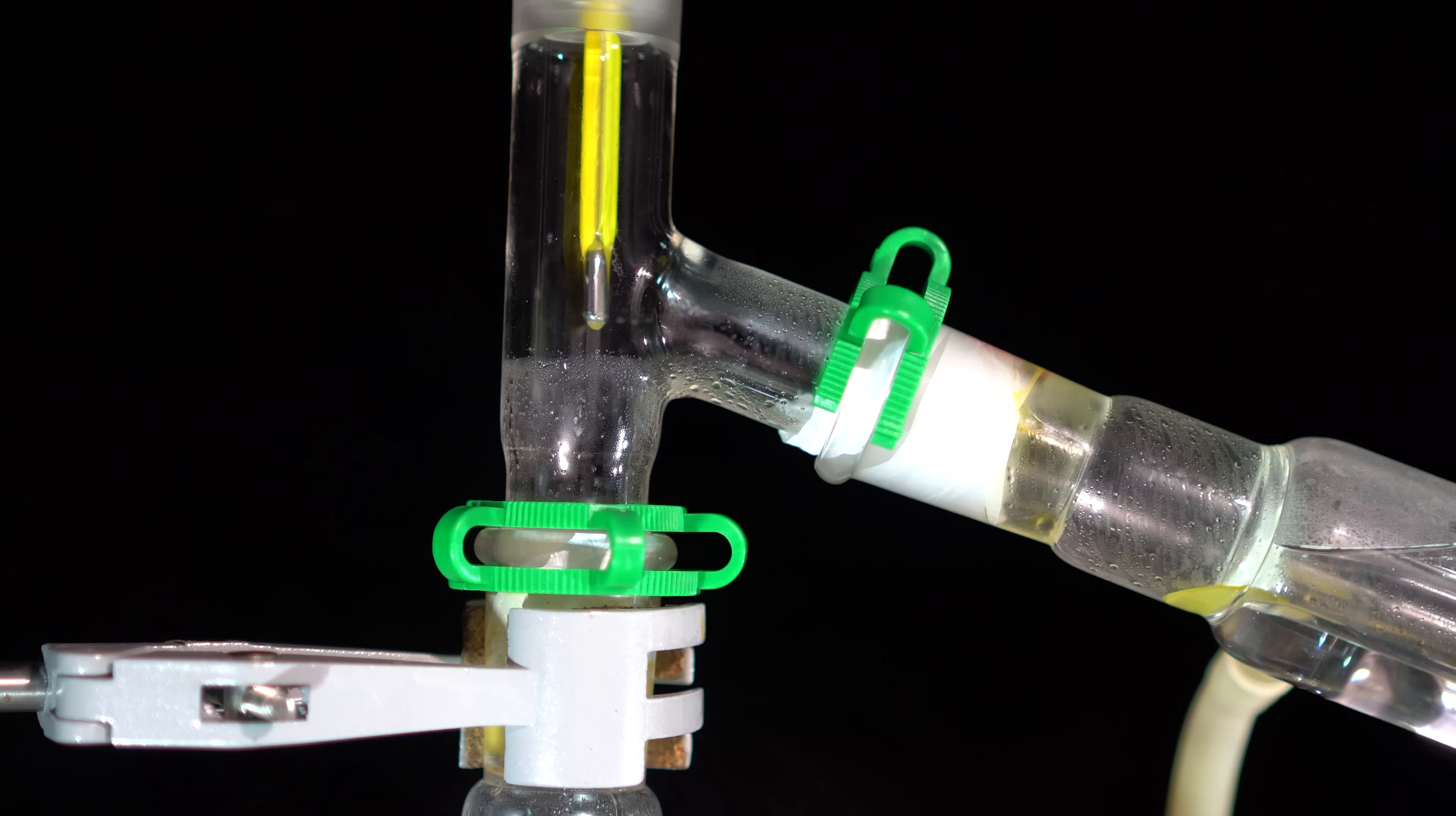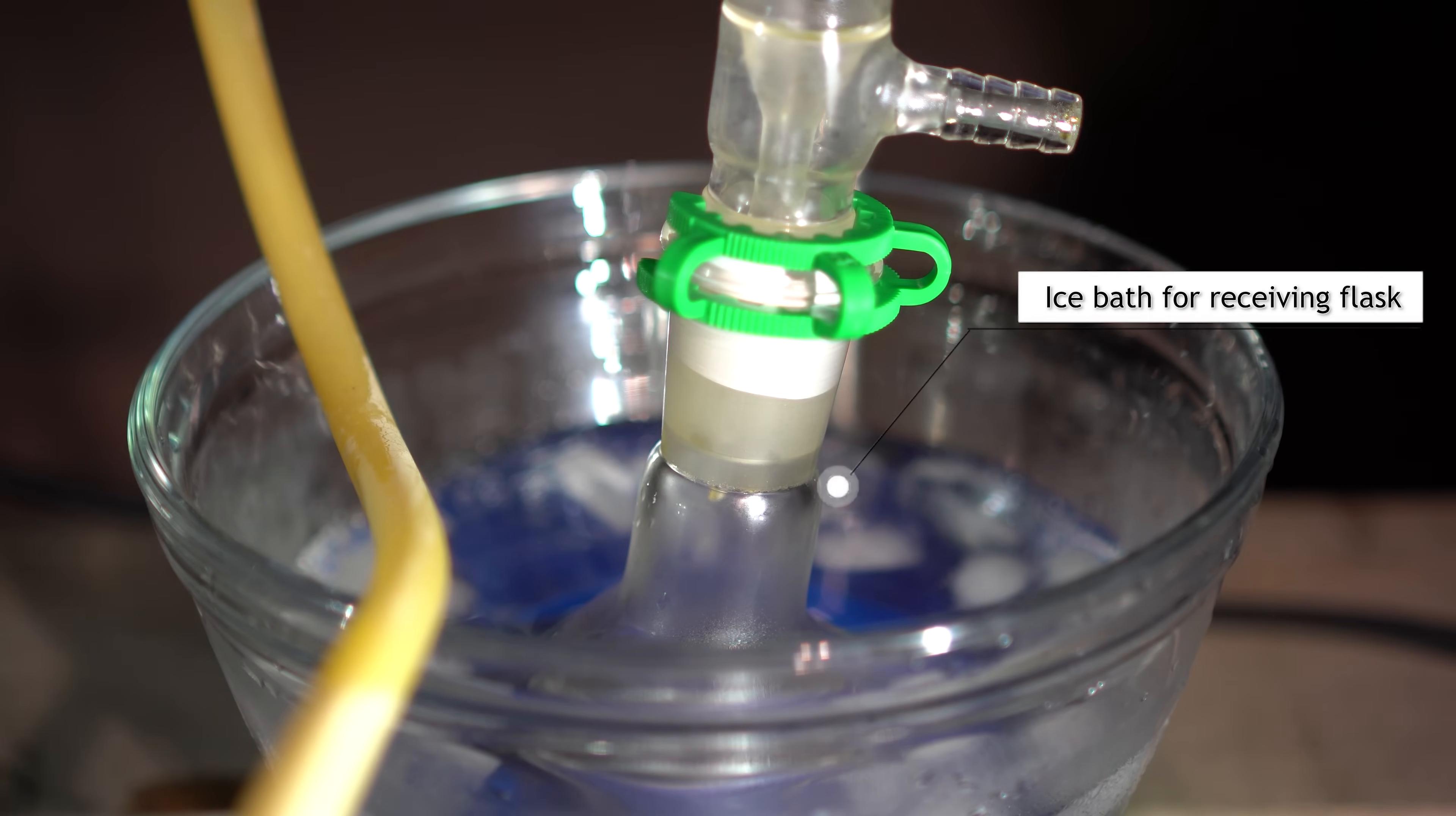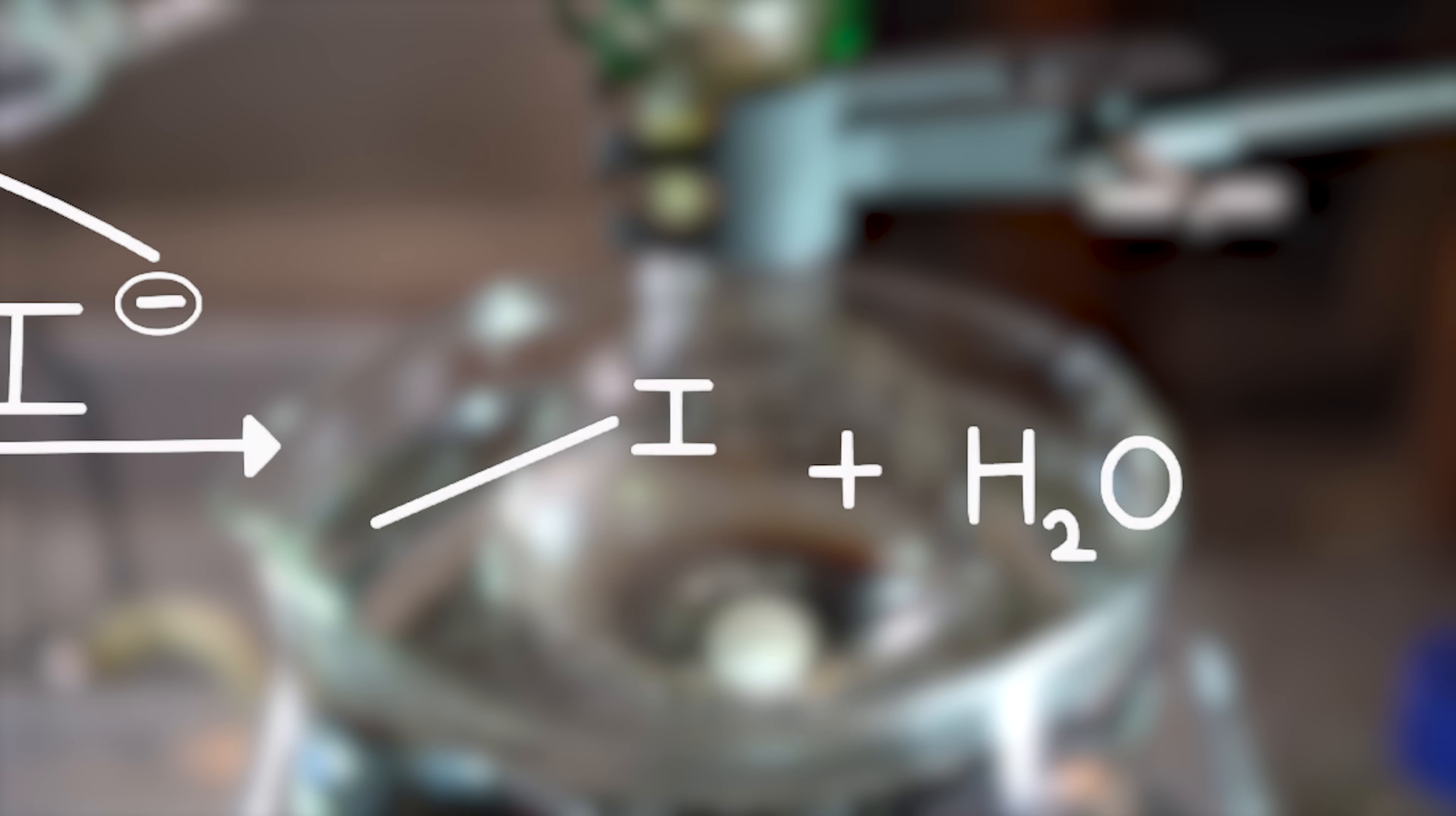Iodomethane has a boiling point of 42 degrees Celsius, and it should come over around that. Though, what's actually happening in this reaction? Let's dive into the beautiful world of chemistry. In this reaction, the function of the acid is to produce a protonated alcohol. The halide ion then displaces a molecule of water, which is a good leaving group from carbon. This produces an alkyl halide. In our case, iodomethane is formed. Primary alcohols and methanol react to form alkyl halides under acidic conditions by the SN2 mechanism.